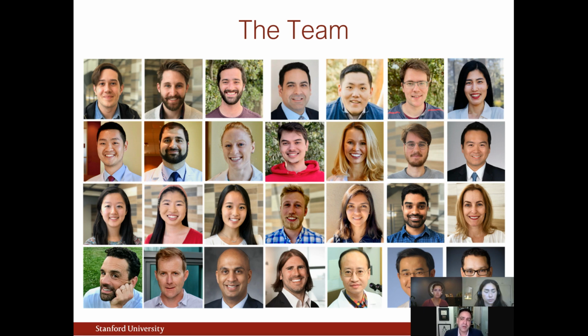And so I think proteomics is really incredibly important for the pipeline. The chemistry is really complicated. The informatics are complicated, but I think all of those steps have become more accessible. You can see from this last slide how many people are involved. I mean, it's a huge endeavor to run that whole pipeline. But like I said earlier, I think the opportunities are pretty amazing.